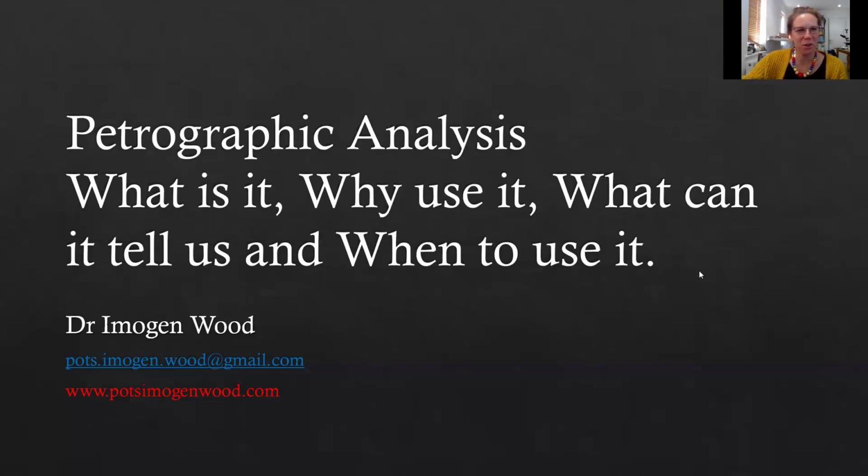Okay, so what we are going to talk about is petrographic analysis. What is it? Why use it? What can it tell us? And when to use it? I think those are the very important pieces that you really need to know if you're starting out and looking at this and considering it perhaps in a project.